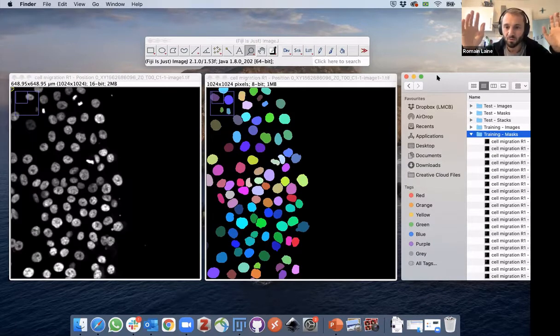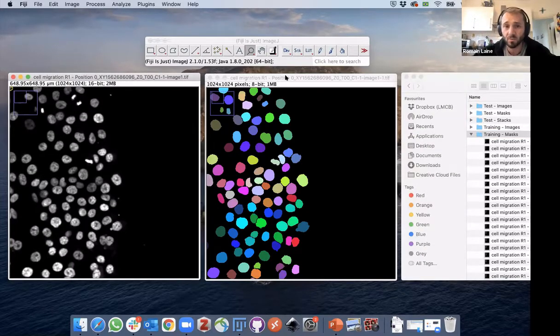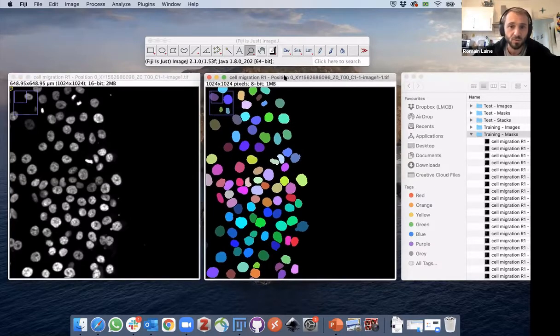We've also provided, as Guillaume just highlighted earlier, a couple of hints of things that we've learned along the way by playing with all of those notebooks, ways to make the curation and generation of the training data set more efficient, easier, less time consuming. So we've started also building tools around this, and we can talk about this at some point if you guys want. And actually, Guillaume will show you a way to do this for Stardist a little bit later on.